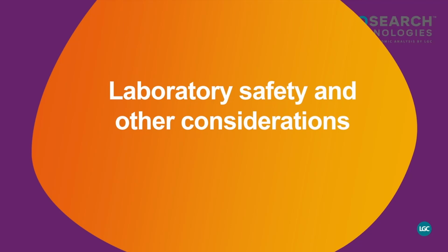So before you even start setting up the lab, you need to clear some hurdles or set some things in place before starting the process.